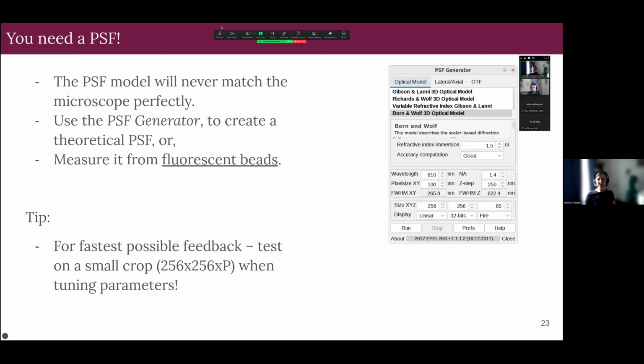So you're going to have to do the same thing with your data. You can do that in 2D or in 3D, right? In this plugin, you can just download a 2D or a 3D image. Yeah, it works on 2D as well. Then you could select Richardson-Lucy for both of them. We're going to try and see what the impact is on the images that you have.